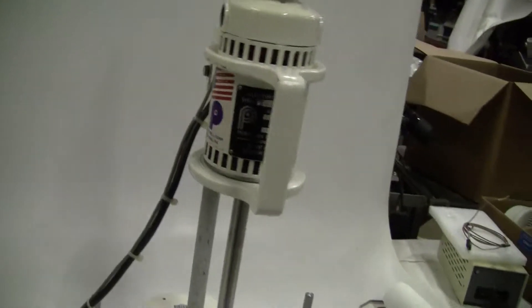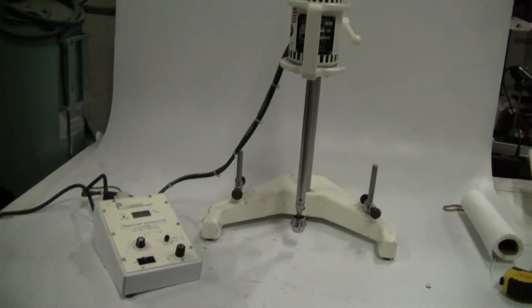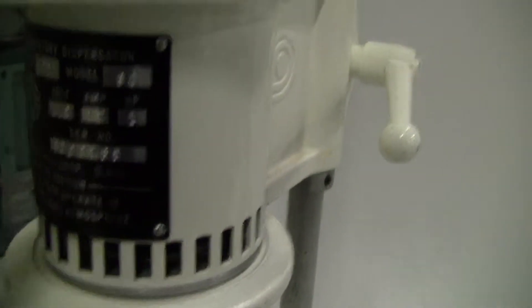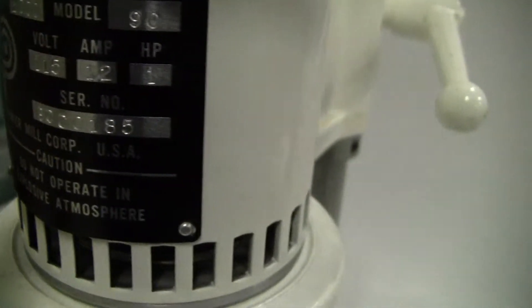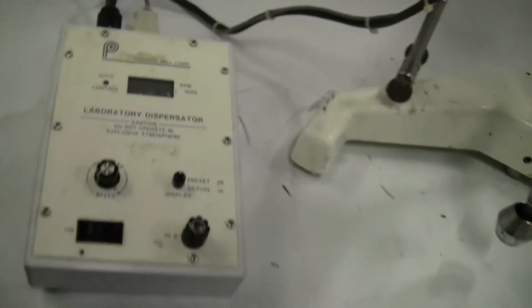Hi, this is Jim from HightechTrader. We're looking at a Premier Mill Laboratory Dispersator mixer. It is a series 2000 model 90. You can see on there: 12 amp, 115 volts, goes up to 15,000 RPMs.